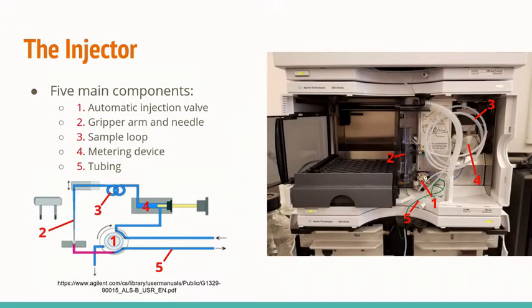One important part of this chromatograph is the sample injection system, which introduces the sample into the machine for analysis. It typically contains a valve with a set of 6 ports that are each connected to a different part of the chromatograph that the various chemicals introduced run through.